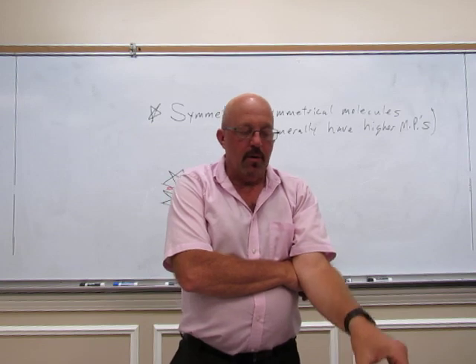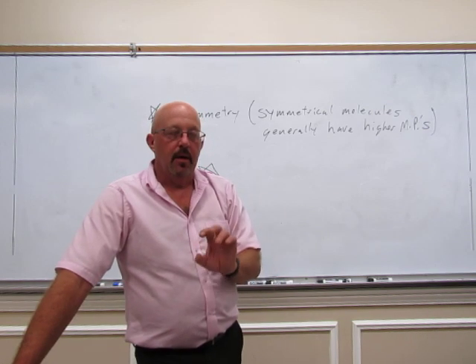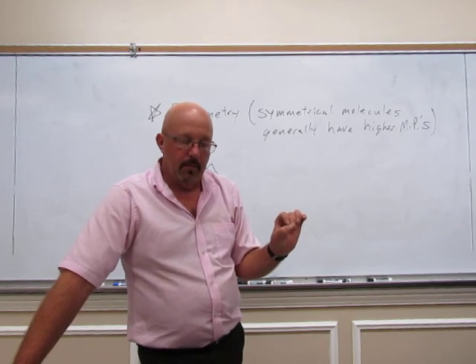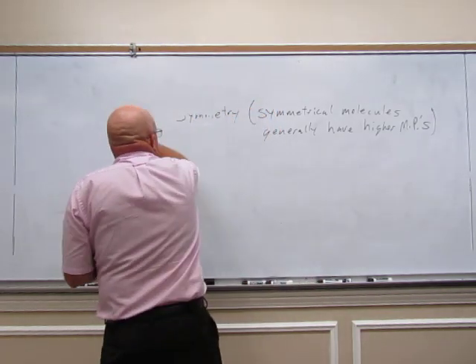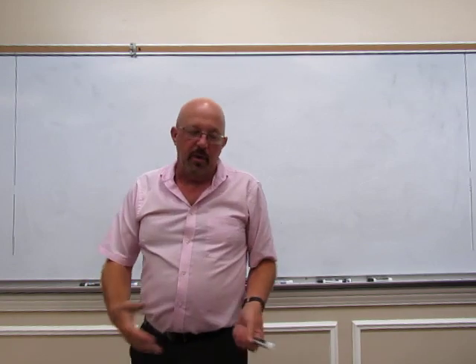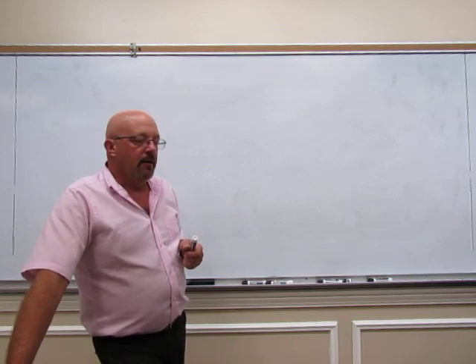So what we're going to do is we're going to save those samples. You're saving the 2 recrystallizations. Remember, don't forget to save a little bit off that first one. And then we got all of the second one. You can save those till next week, and we will get a melting point on those next week. That will give them a full week to dry. And the melting point doesn't take long. I know we have another lab next week. We have sublimation. Sublimation is a quick lab. And then all you'll have is just the melting point to take from this week's lab.